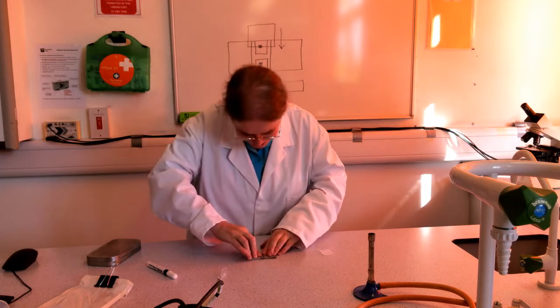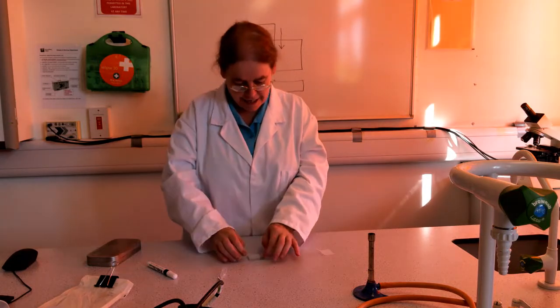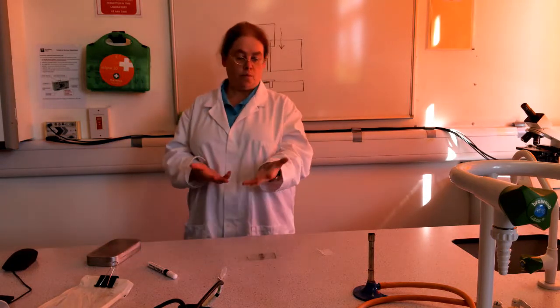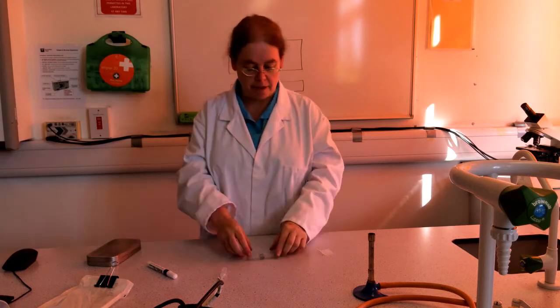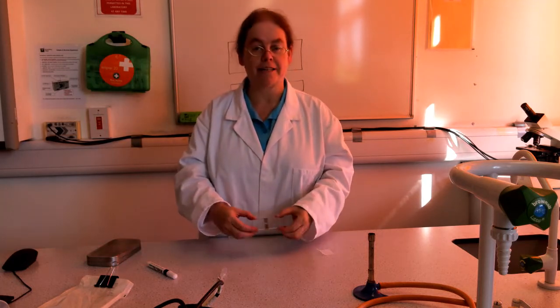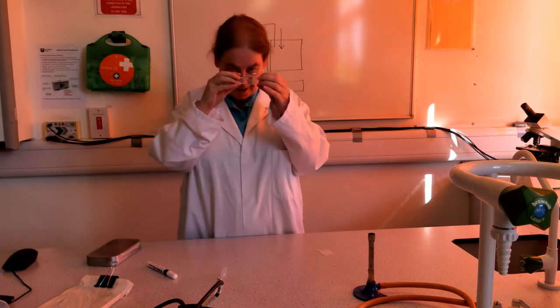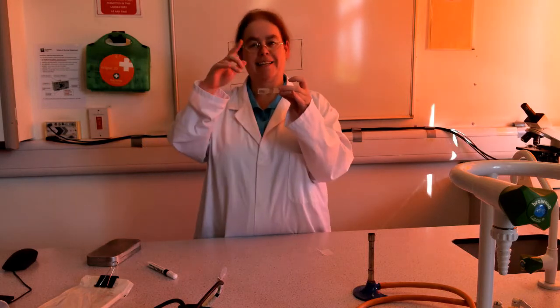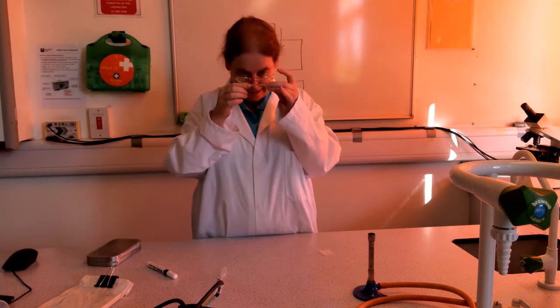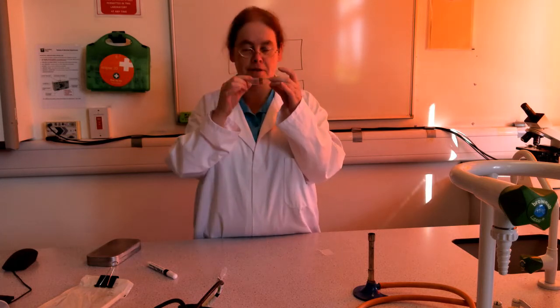Not very sterile, blowing on it, but then whatever's going in the haemocytometer doesn't need to remain sterile anyway. That's better. Right. Also, you can kind of see what they call Newton's rings. I never quite know what causes them. Little rainbows to tell you it's stuck. If you were in the lab, you could see pretty rainbows.